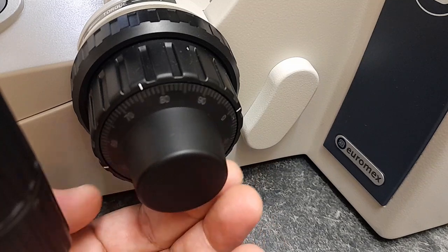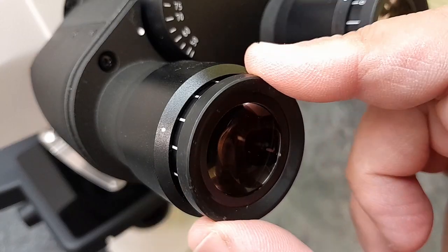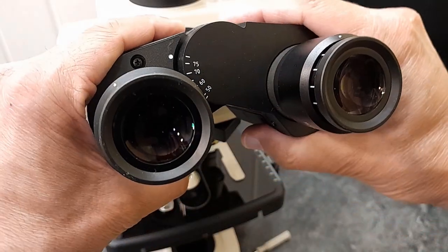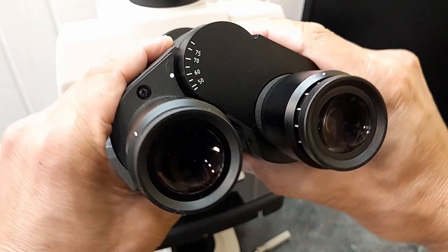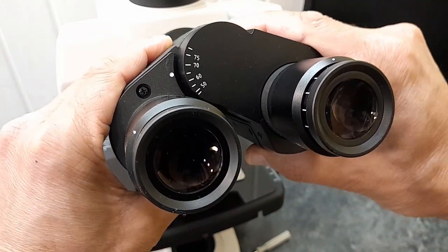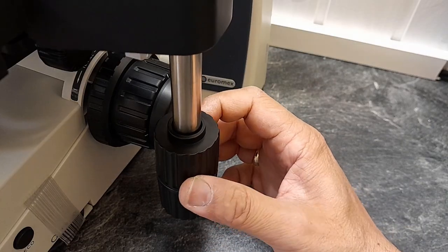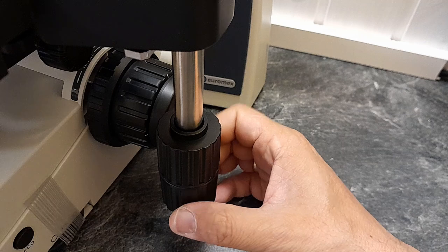There is of course also a diopter adjustment on each eyepiece possible and the distance between the eyepieces can also be adjusted. Of course, there is also a light intensity control. And I have to say that the brightness of the microscope's lamp is quite high as well. The knobs for controlling the mechanical stage are also quite large and very nice. You're even able to adjust the tension of the mechanical stage. You can do that by pulling down on the knobs and then you're able to rotate them and to adjust the tension.